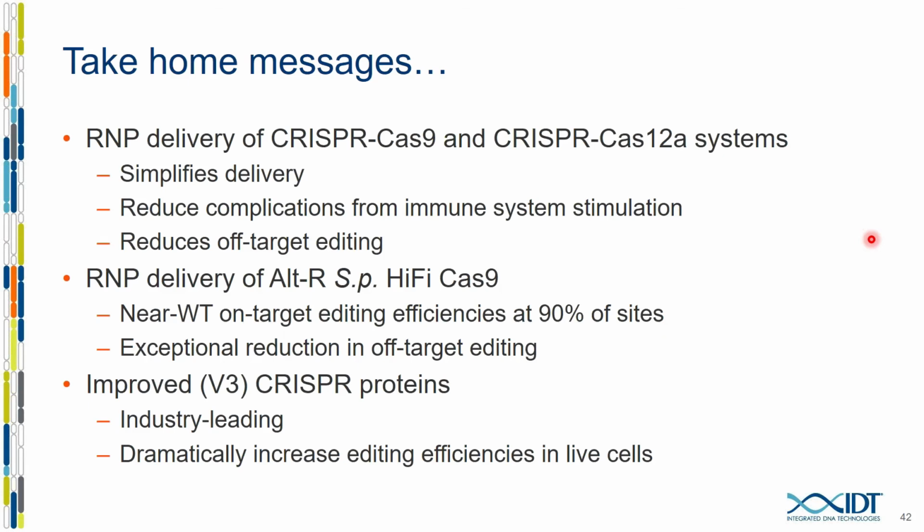Yeah, so there are a lot of questions. HDR is obviously more complicated. Do you use enhancer? Do you not use an enhancer? What concentrations do you use? And I think the best thing I can do is direct you to that app note on our website. Yes, and we are actively working on ways to improve HDR as well, and we'll have more information on that as it comes out. Yep, absolutely.